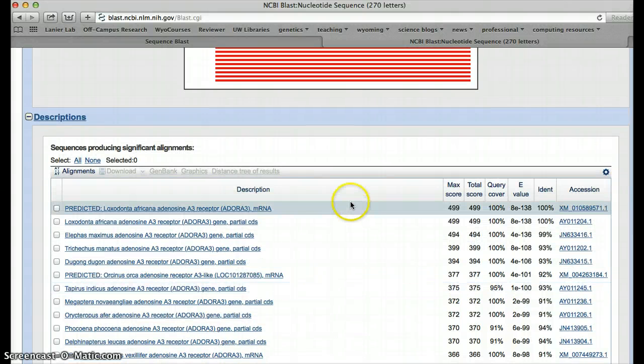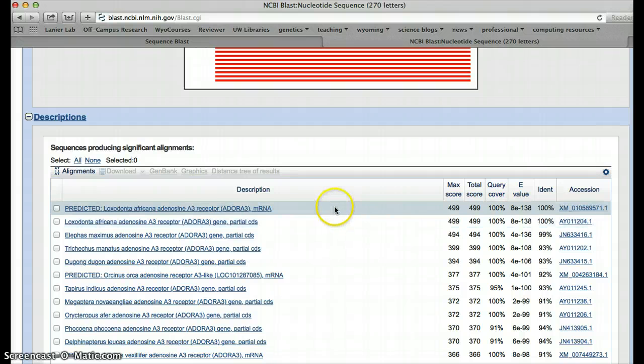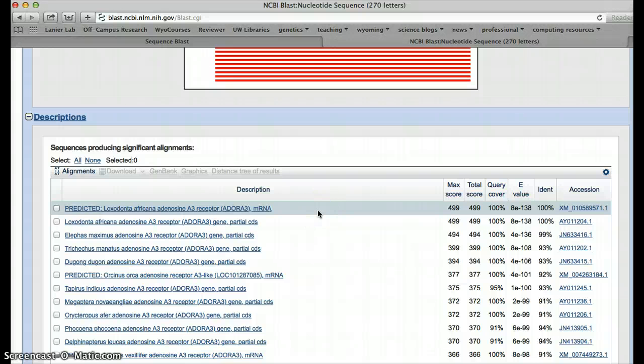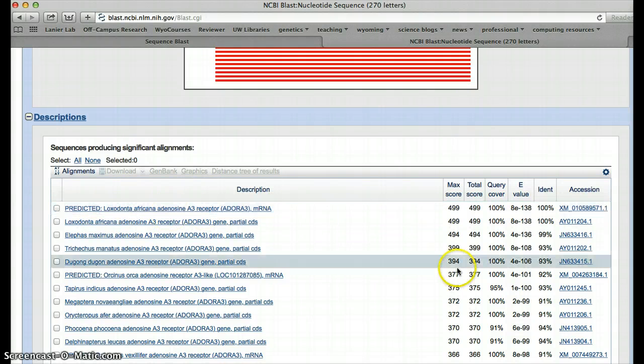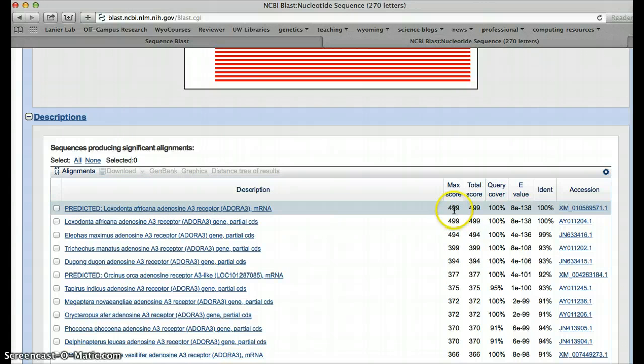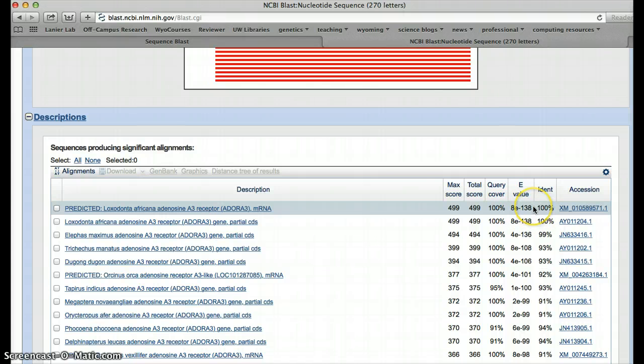So we've got a series of different predicted similarity or similar sequences. One of them here, the one that's at the top of your query, is actually the one that's most similar. What we see here is we've got a description of the sequence. The sequence is from Loxodonta Africana. It is very, very similar. It's 100% similar or 100% overlap with the query coverage, and that is 100% identical. And it's got an E value that's very, very small. We'll see what that means in a second.